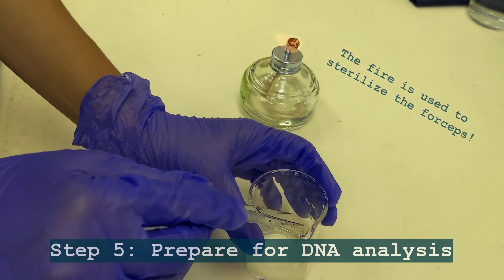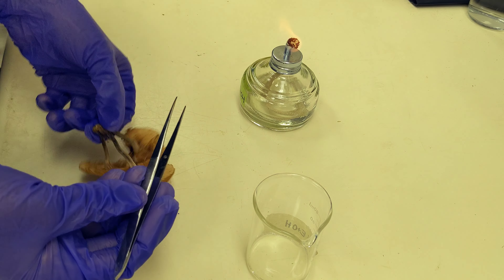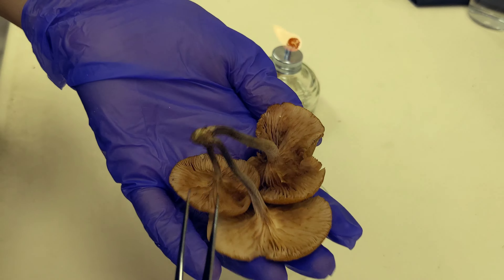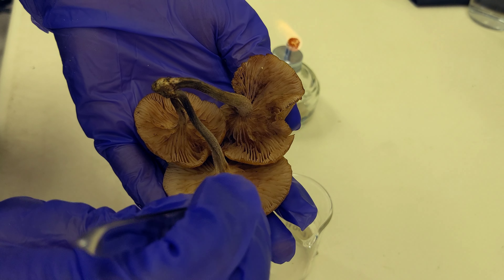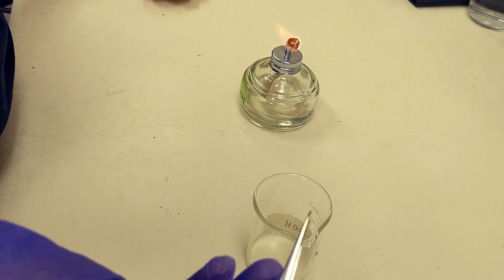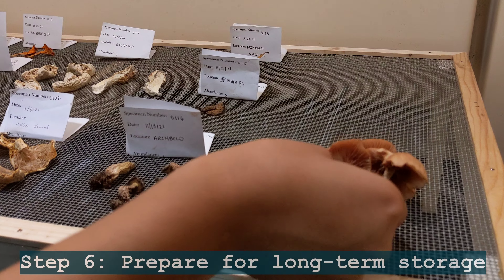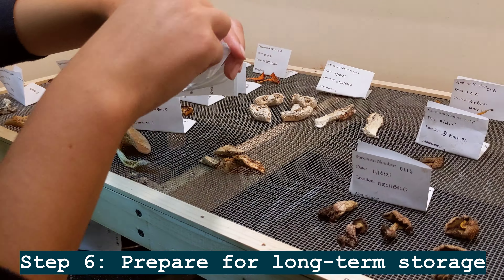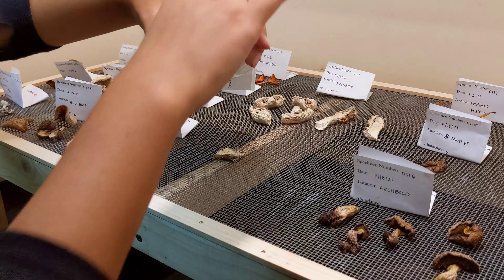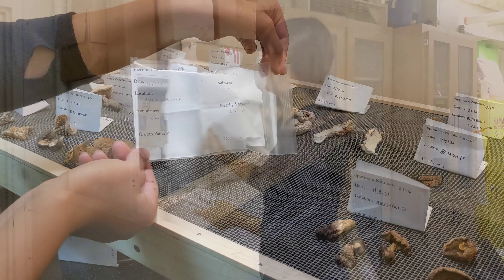Now that we've taken pictures, there are two last steps. The first one is prepping for molecular analysis. For that procedure, we'll take a small part of the mushroom's tissue and put it in extraction buffer, which will preserve the mushroom so that we can later run DNA extraction, amplification, and analysis. The next step is drying out the specimen, which is done in the fume hood for two weeks. After that, the specimen is stored in the freezer for 24 hours.